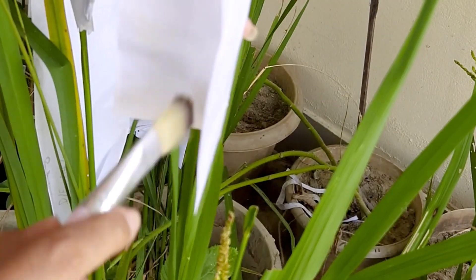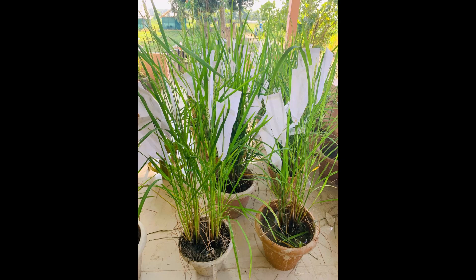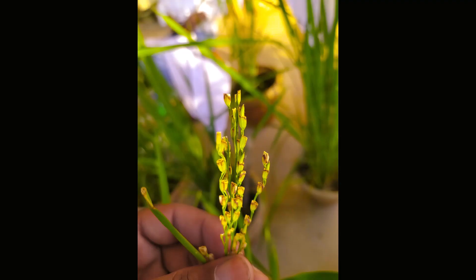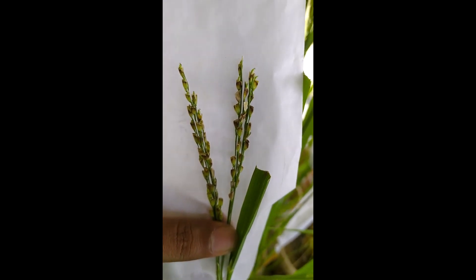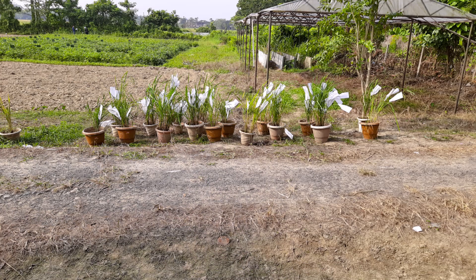After pollination is done, immediately the same butter paper bag is used to cover the panicle. After that, tagging is done with the information as mentioned on the butter paper bag. This completes the procedure of emasculation and pollination in rice. In general, seed setting occurs within 5 to 7 days after pollination. Proper irrigation and sunlight must be provided for healthy seed setting. Necessary care must be taken to prevent formation of molds or fungi inside the bags by making small punctures with a needle for proper aeration.